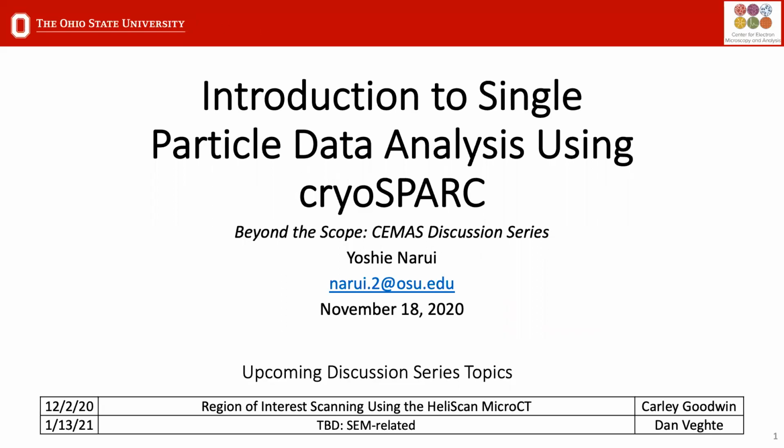Okay, so over here on the left, you'll see a list of all the micrographs that are available. So there should be 20 in this particular data set. And if I click on any of them, it will update with the correct image. Now you can categorize these any way you would like to. So if I click on defocus, it will put them in from the highest defocus to the lowest defocus. I usually like to start with high defocus when I do particle picking because I have the most contrast and I can pick particles relatively easily. We'll just stick with the default box size.